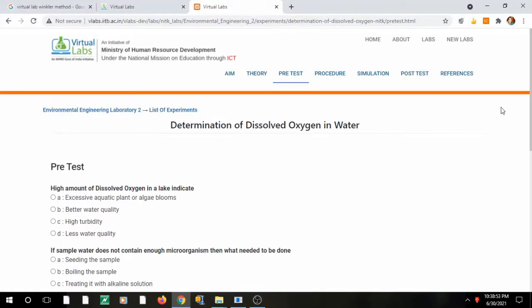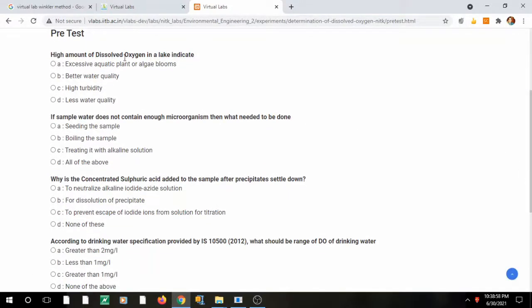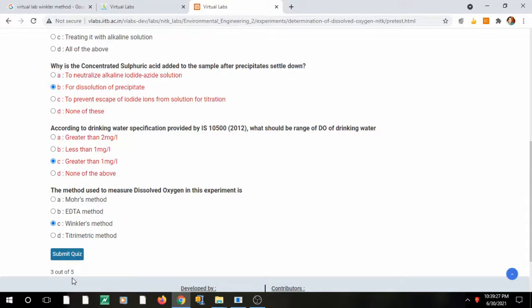There is also a pre-test, where you can test yourself before proceeding with the experiment. For example: 'A high amount of dissolved oxygen in a lake indicates what?' — better water quality. 'Why is concentrated sulfuric acid added to the sample?' — for dissolution of the precipitate. 'According to drinking water specification, what should the range be?' — and the method used is Winkler.